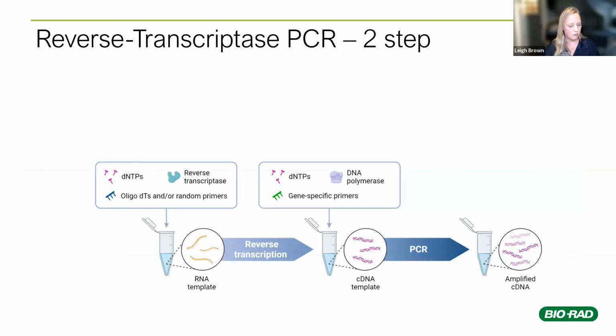So typically now what's going to need to happen is when you're doing these gene expression studies, again, from the cell, you can do this reverse transcriptase PCR. Two different ways to do it here. In this example, we're looking at a two-step method where you have your RNA isolated from the cell, right? So here's our cell, here's our RNA down here.